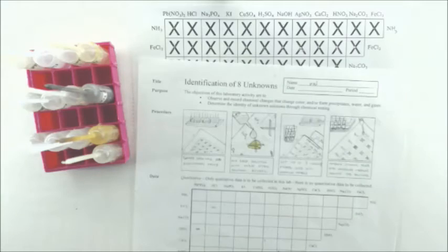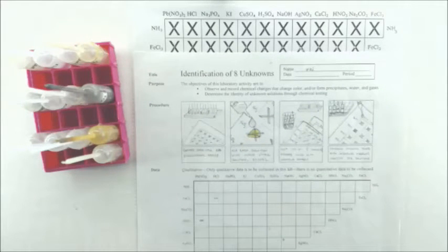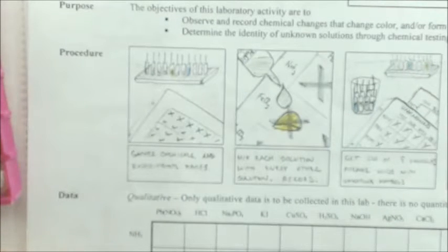All right, so procedure-wise, we have a fairly simple procedure. It's really just adding a bunch of drops of one chemical to another. I'll be doing this part right here. Got the materials together already. Got my 13 knowns over here.